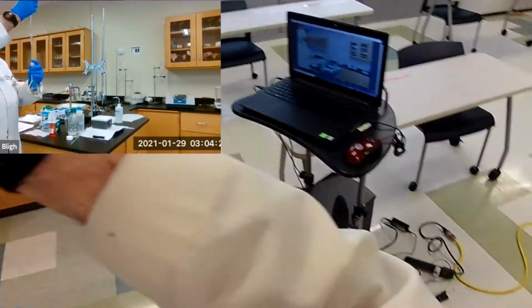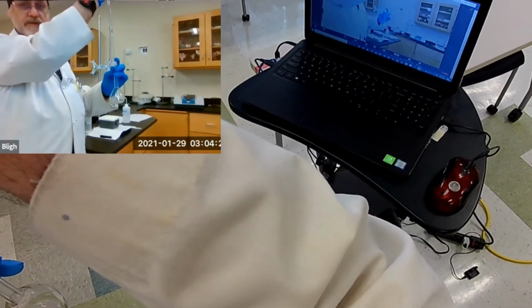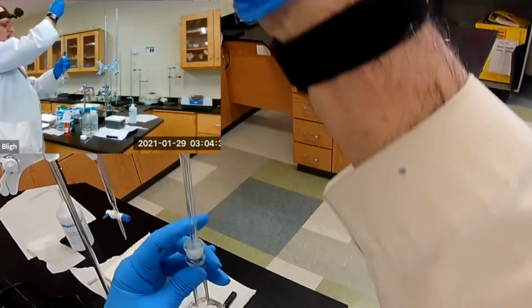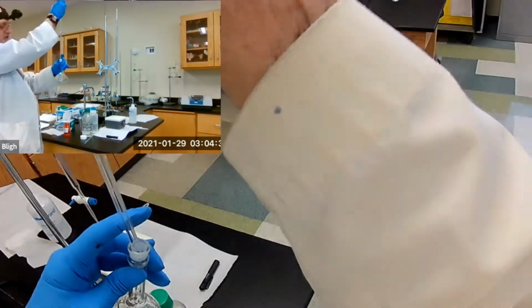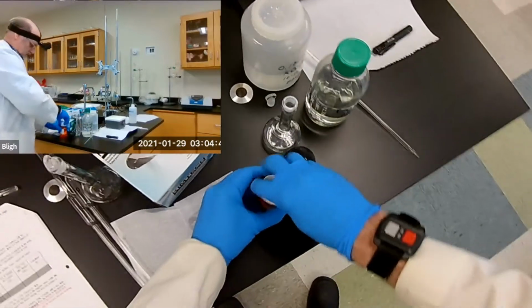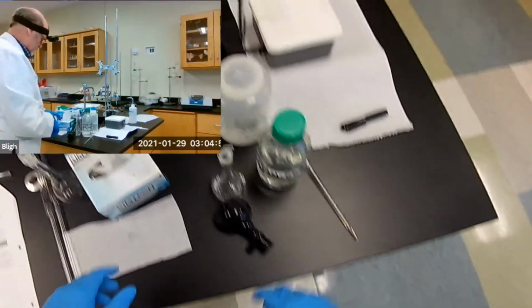And you just wait for gravity to do its thing. Let's see. I'll shift this with my foot just a little bit. There you go. Almost drifting off camera. Okay. And then the last thing you do is touch the tip to the inside, and we're done with the silver. Okay. Set that aside and clean it up later. Or we might use it later. So we'll keep them together. Right. We might prepare the stronger solution if there's time.